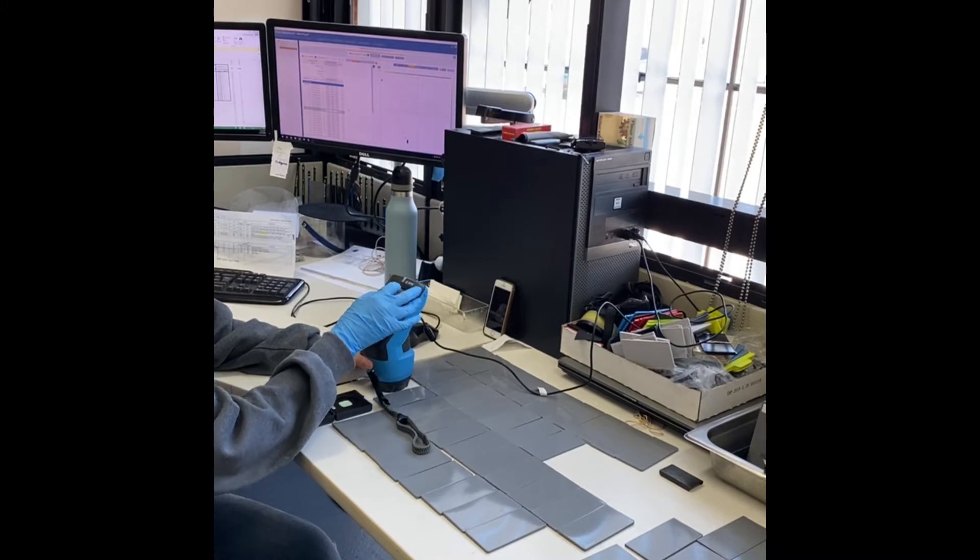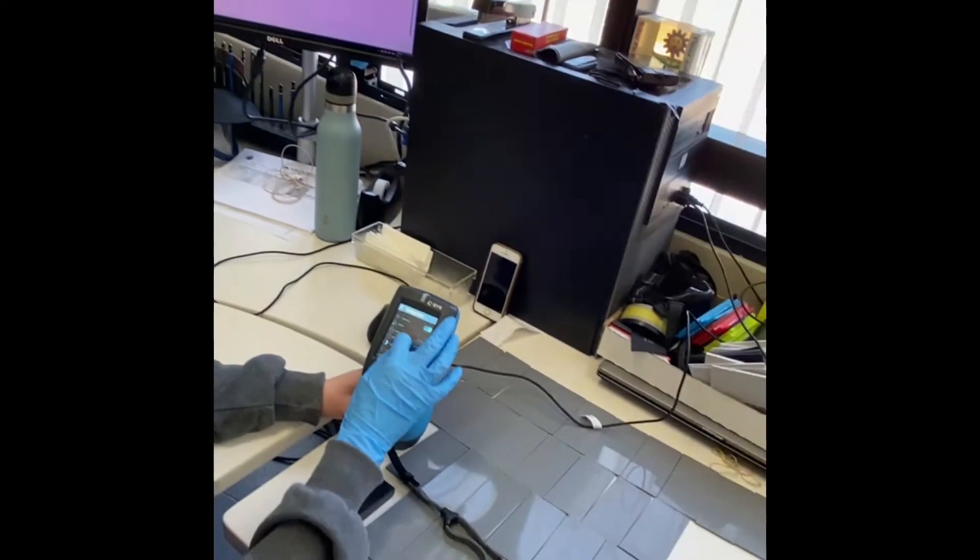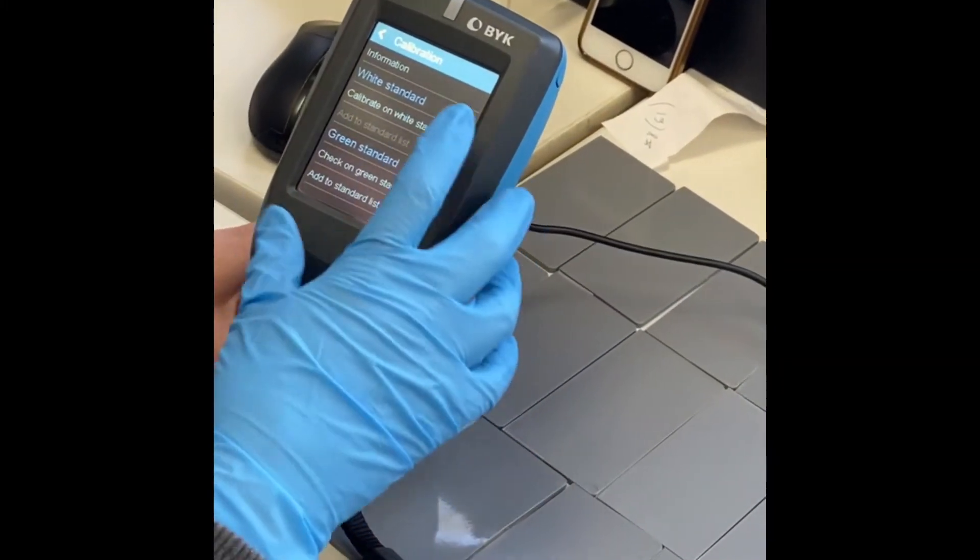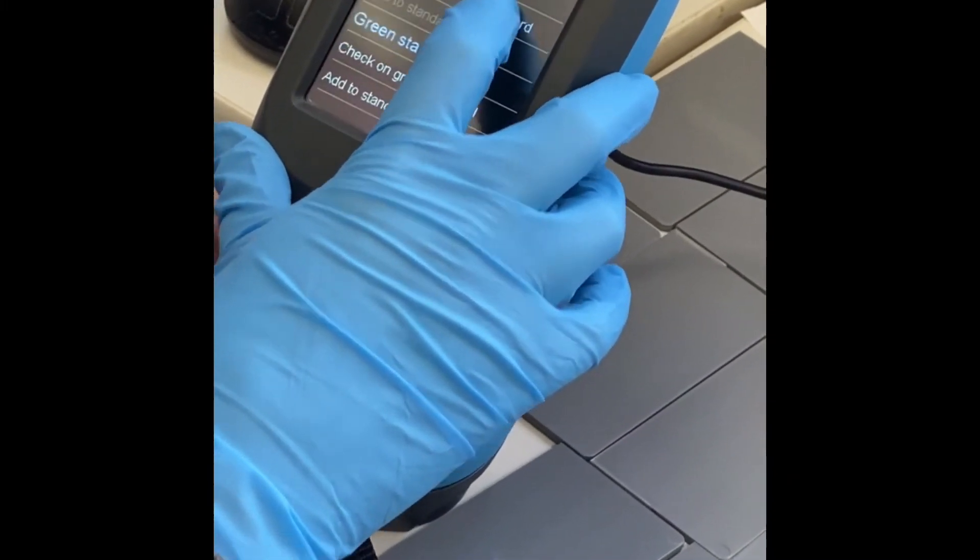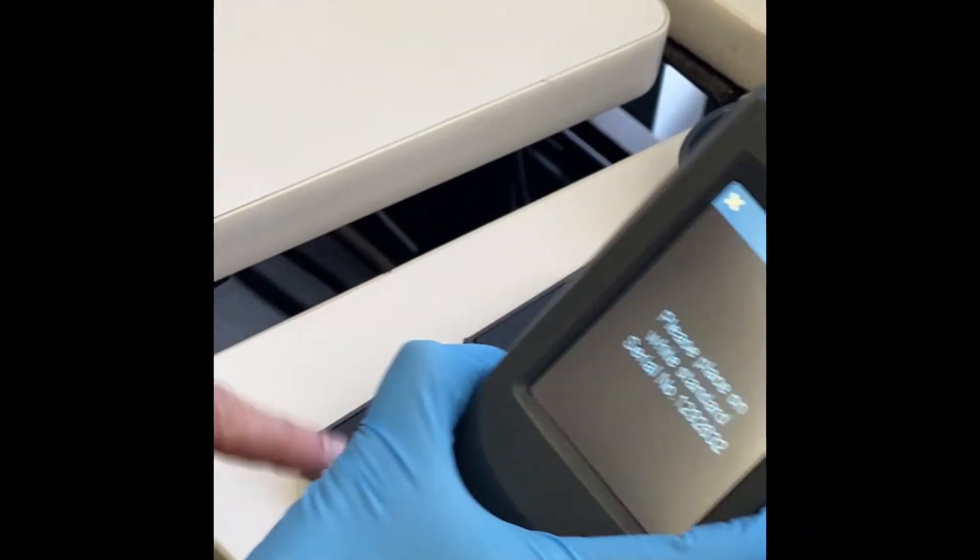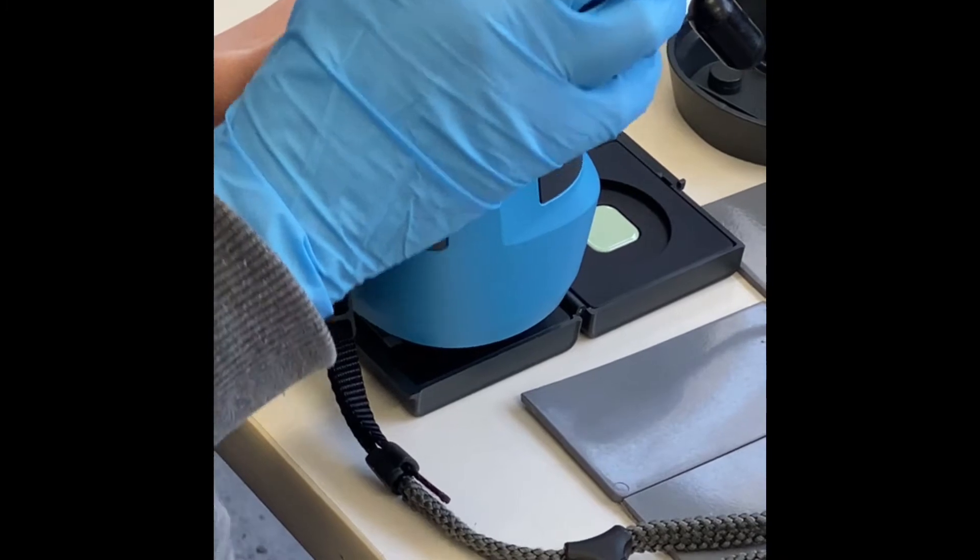I go to the settings, and then I choose the calibration and then calibrate on white tile. And then it asks me to place it on the white tile, that's the number here, and then I just push the check mark.